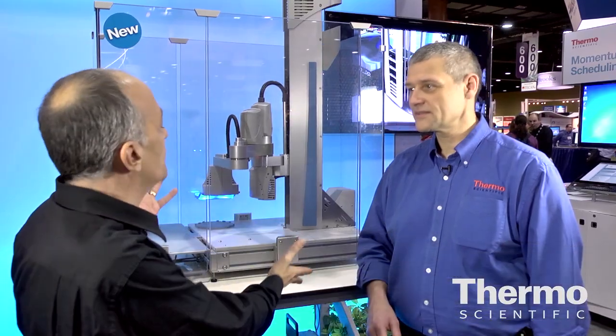We're talking about laboratory automation with Dean Mulek. He's an expert in this area of the business. Dean, tell us about this great unit.